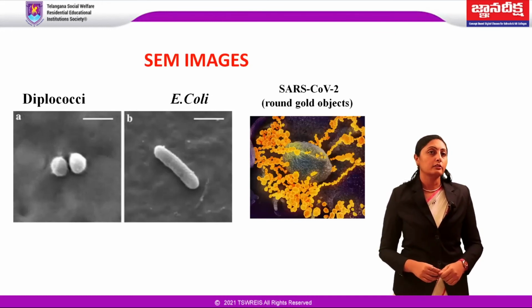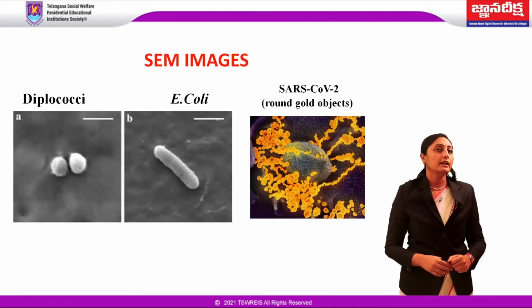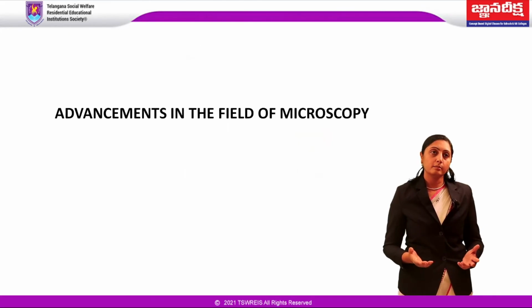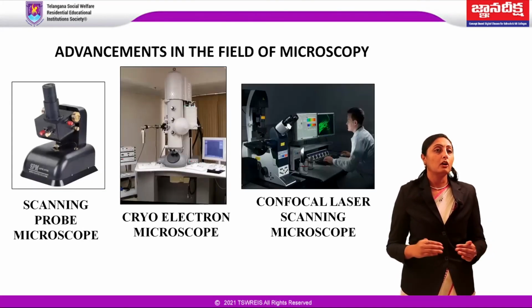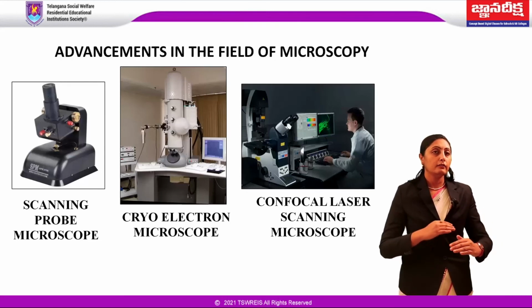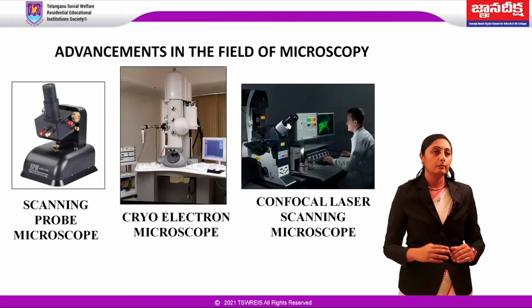The field of microscopy has been constantly evolving over the years. We have the development of various microscopes like confocal microscopy, in which by altering the focal length, different focal planes of the specimen can be viewed and imaged.